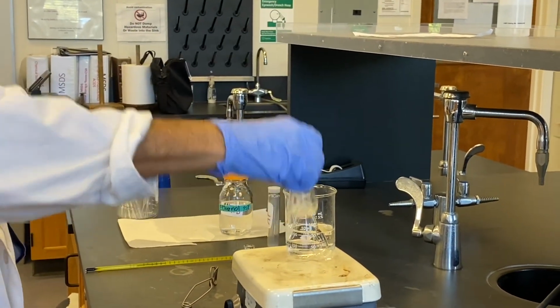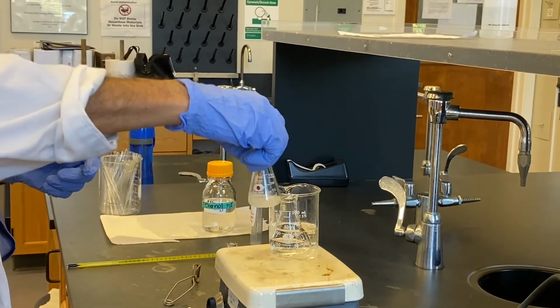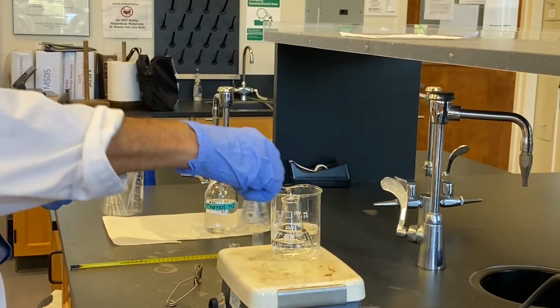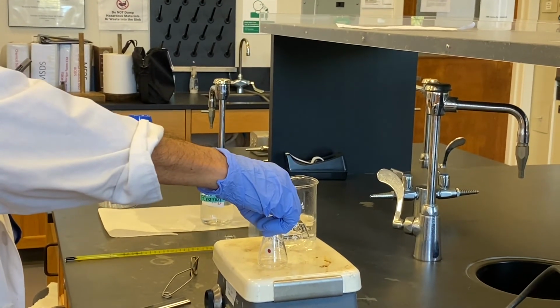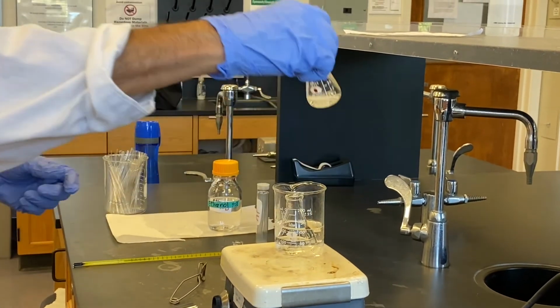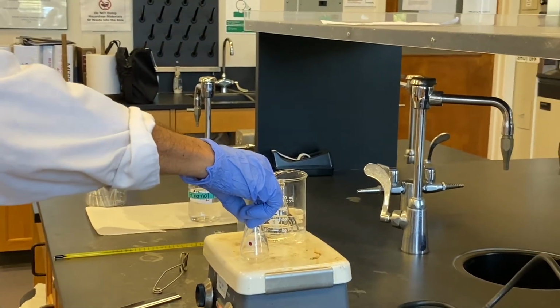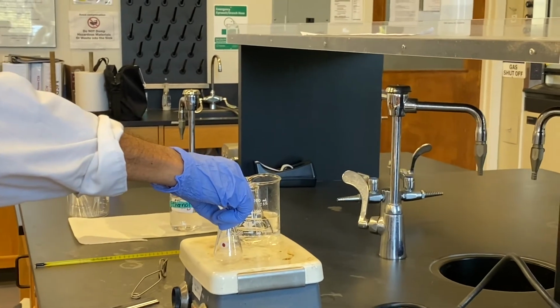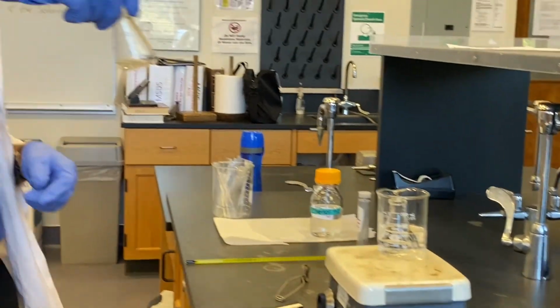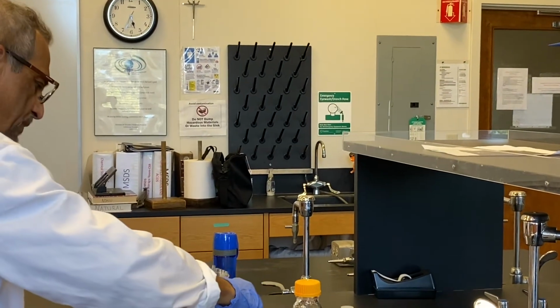There's one crystal. Because it's crystalline, it takes a little bit more time. Okay? Yes. So this is a clear solution now. Okay. So now I'm going to keep this here. You can see this clear solution dissolved in alcohol. I'm going to keep it here for crystallization.